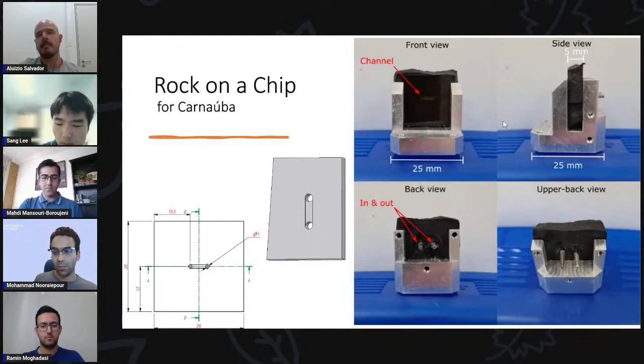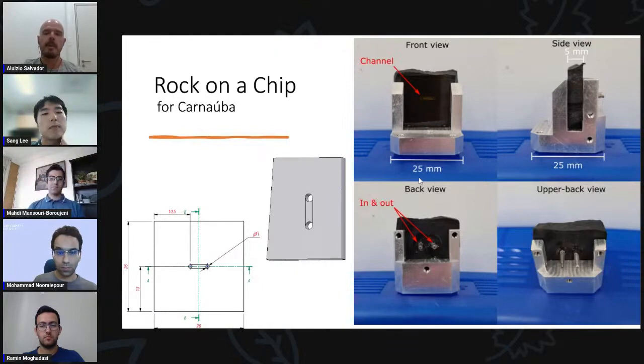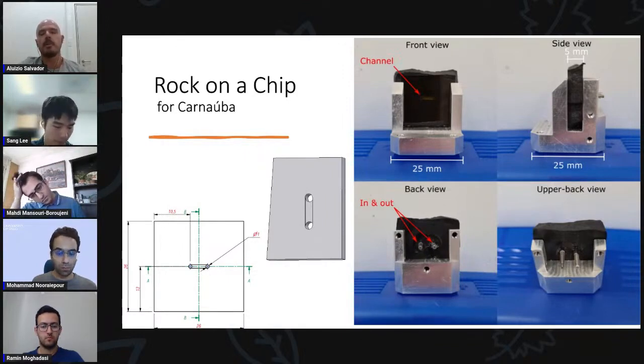Here on the right, in the pictures, we show our sample, or real rock, with 5 millimeters of thickness. On one of the flat surfaces, we have the channel drawn with the 2 holes. And from the back view, we can see the inlet and outlet of the fluid. The goal here is to use a peristaltic pump, so we can inject the selected solution into this part, and we have a controlled environment to analyze the mineralization and the results of the interaction between the solution and the rock.